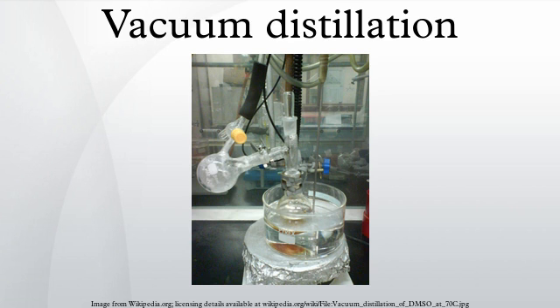Vacuum distillation of moderately air- and water-sensitive liquid can be done using standard Schlenk line techniques. When assembling the setup apparatus, all of the connecting lines are clamped so that they cannot pop off. Once the apparatus is assembled and the liquid to be distilled is in the still pot, the desired vacuum is established in the system by using the vacuum connection on the short path distillation head. Care is taken to prevent potential bumping as the liquid in the still pot degasses. While establishing the vacuum, the flow of coolant is started through the short path distillation head. Once the desired vacuum is established, heat is applied to the still pot. If needed, the first portion of distillate can be discarded by purging with inert gas and changing out the distillate receiver.